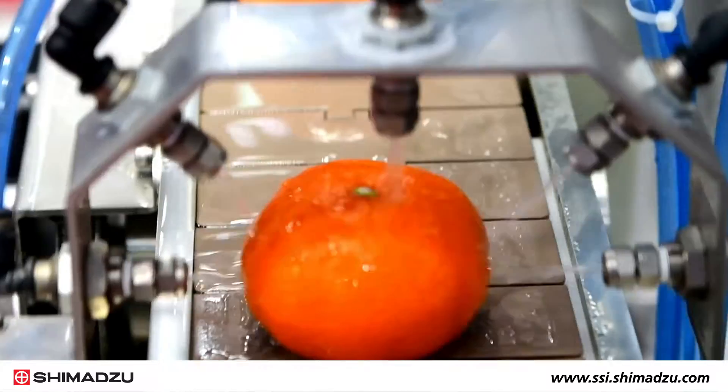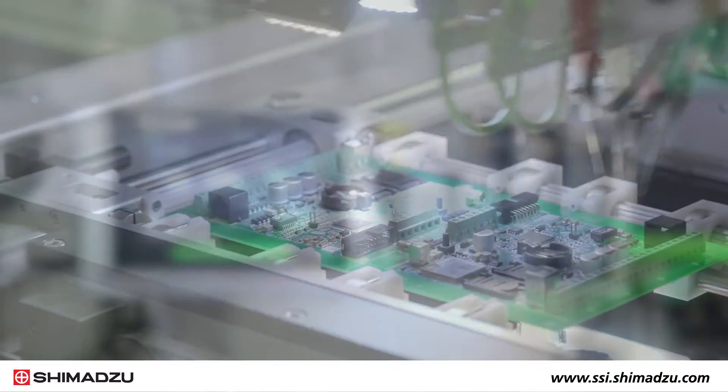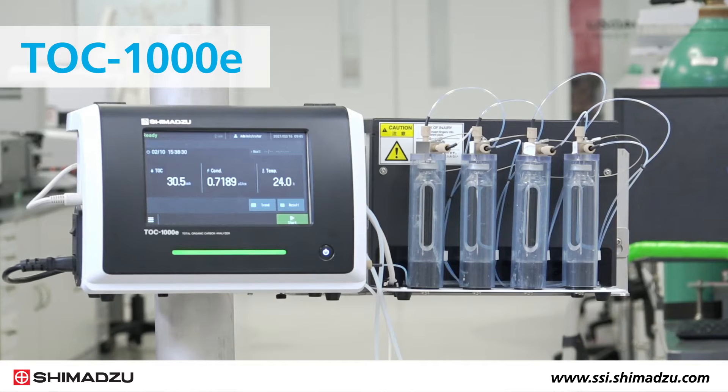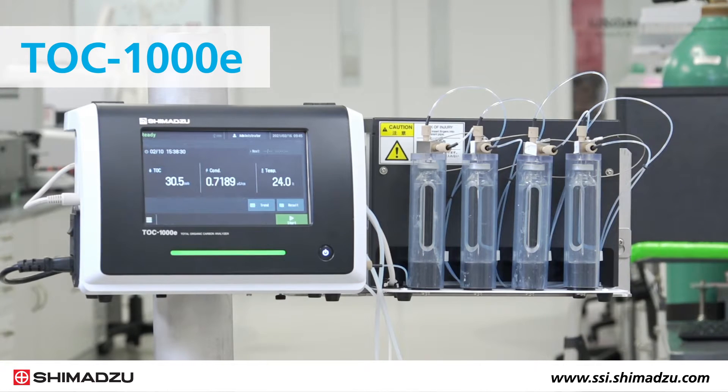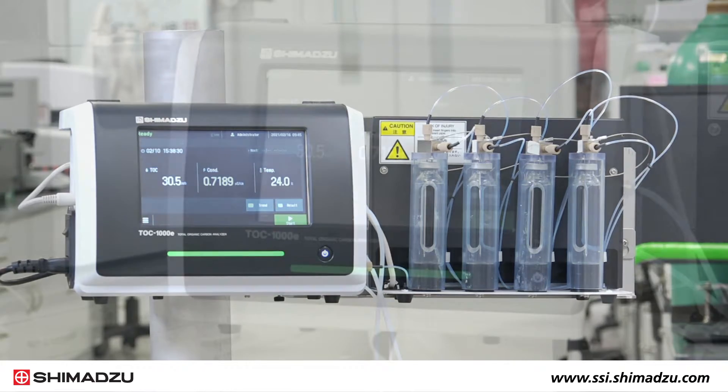Manufacturers across multiple industries need to keep up with the growing demand for purified water. That's why Shimadzu developed the TOC1000E Online Total Organic Carbon and Conductivity Analyzer for pure water analysis.